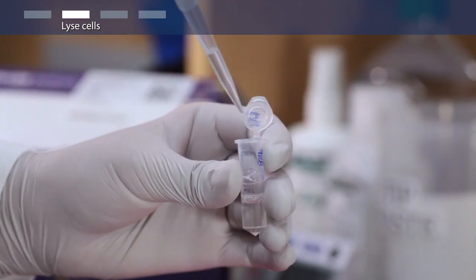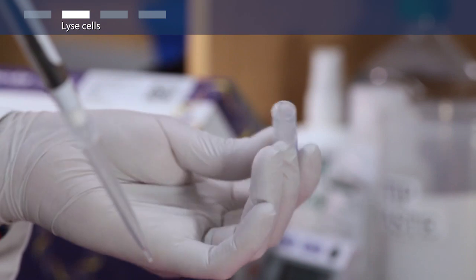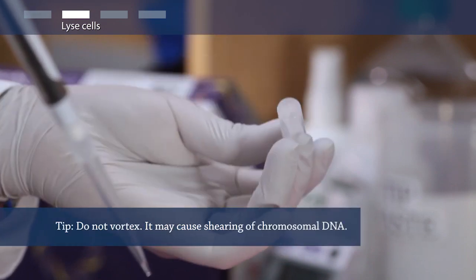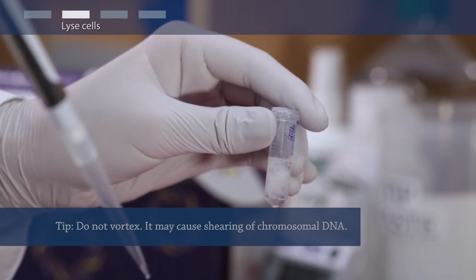Now add 350 microliters of neutralization solution. Mix immediately and thoroughly by inverting the tubes four to six times. The neutralized bacterial lysate will become cloudy.